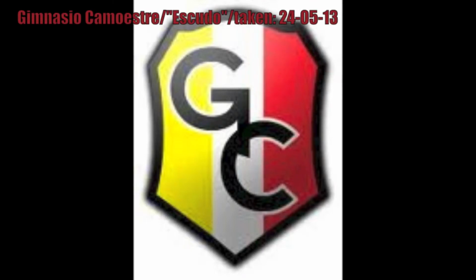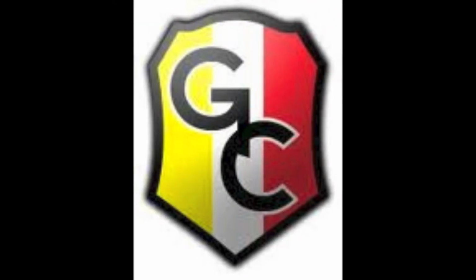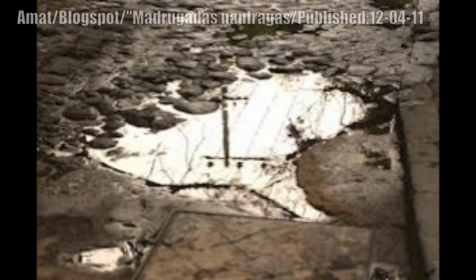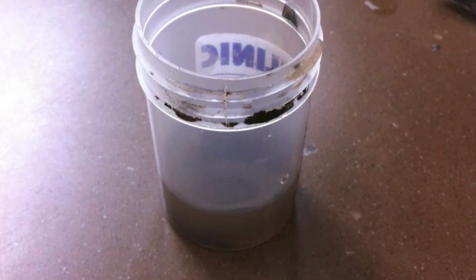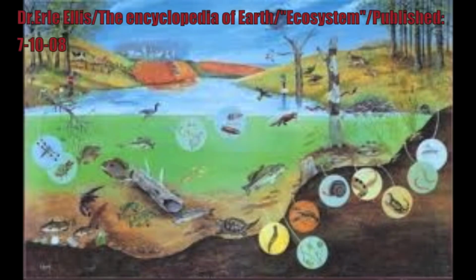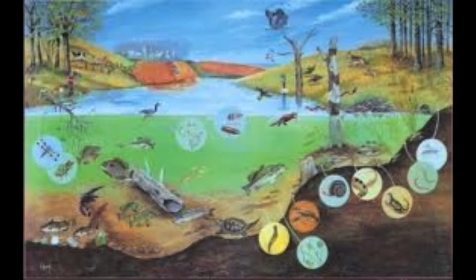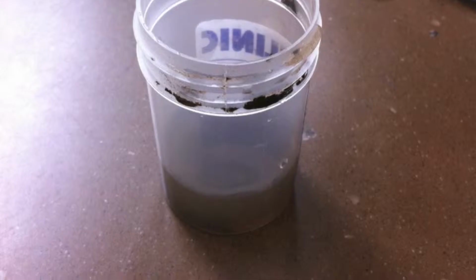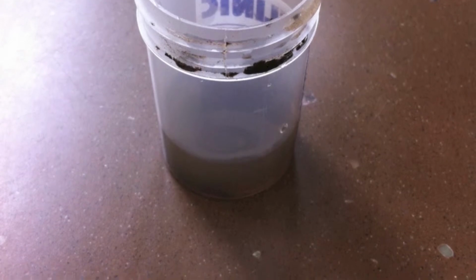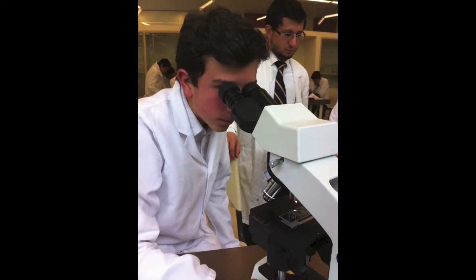Last Friday, May 17 of 2013, we visited the microbiology lab of the Gimnasio Campestre. The objective of this activity was to analyze whether any organism, bacteria, or parasite lives in water ponds in an ecosystem. In order to obtain a good result, each group had to collect a sample of water from a pond and analyze it in the microscope.